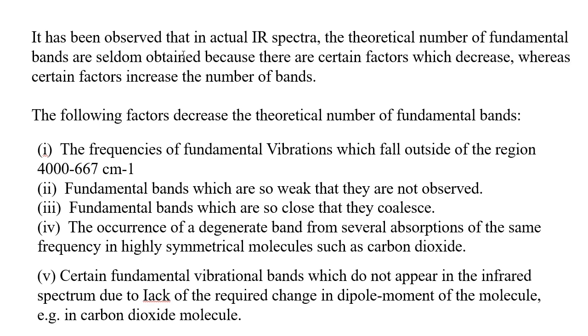But it has been observed that in actual IR spectra, the theoretical number of fundamental bands is seldom obtained, because there are certain factors which decrease or increase the number of bands. The following factors decrease the theoretical number of fundamental bands.